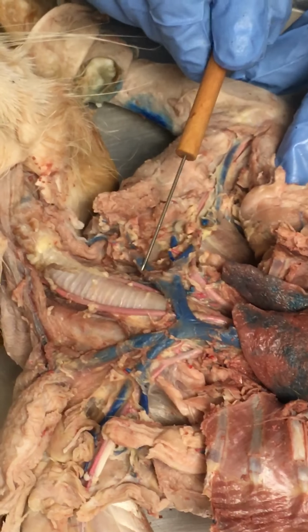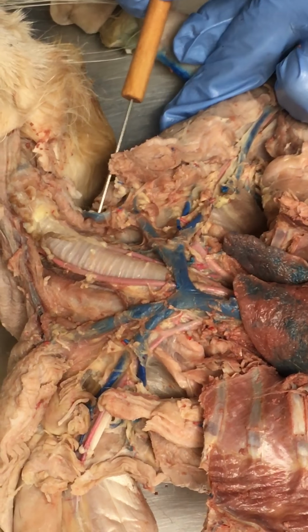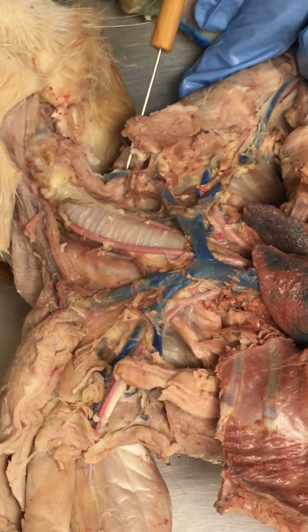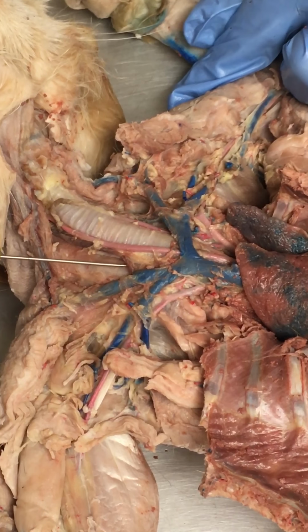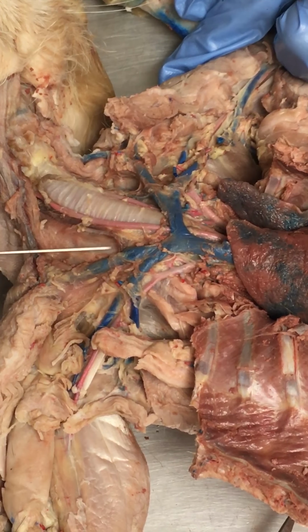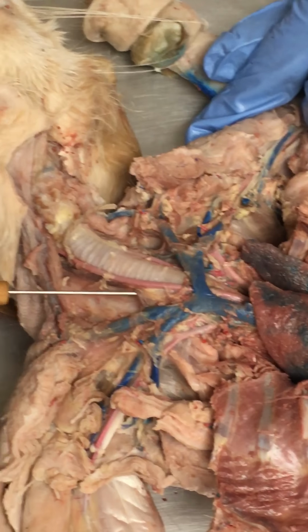This guy, where it branches and goes up, this is our jugular. The big one is our external jugular, and then it's a little hard to see that thinner little guy right there, smaller diameter, that is our internal. So that's our left external jugular and our left internal jugular. We've got the same thing over here on the right side. So here's our right external, and here's a case where we didn't get a lot of dye into one of the blood vessels. This is our right internal. It has an attachment point right there, and it runs up the inside of our throat, essentially next to the esophagus, and that is our right internal jugular.